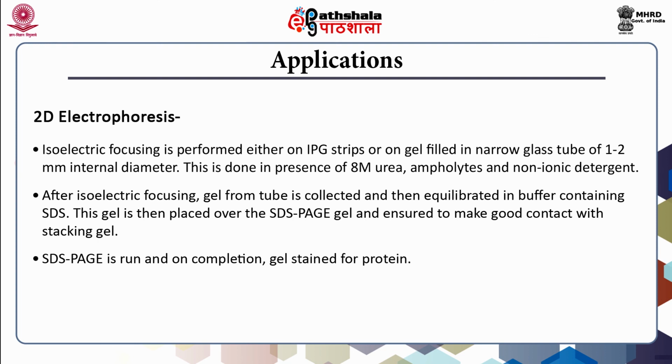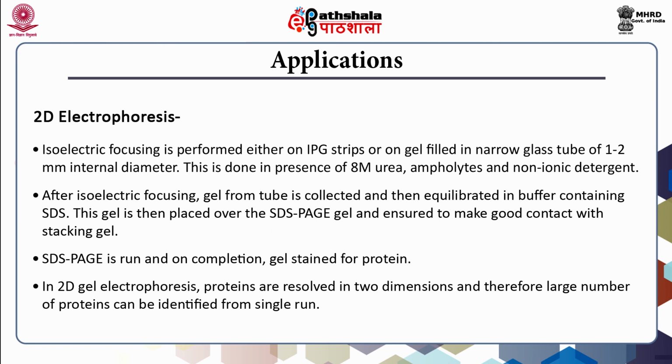On completion of the run, the gel is taken out and stained for protein. In 2D gel electrophoresis, proteins are resolved in 2 dimensions and therefore a large number of proteins can be identified from a single run. The technique is routinely used in proteomic labs.